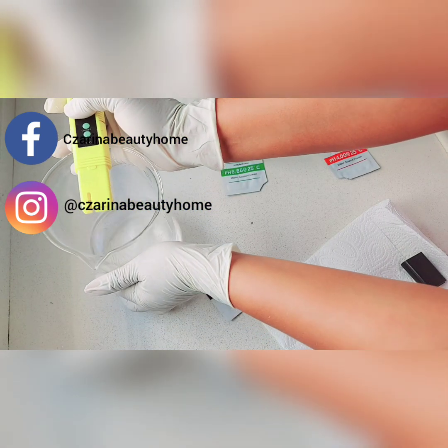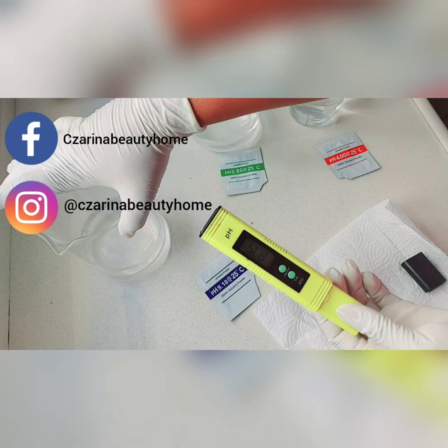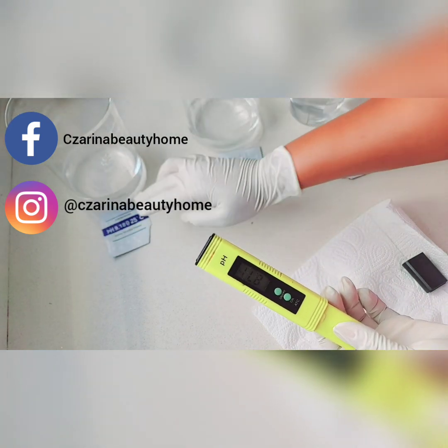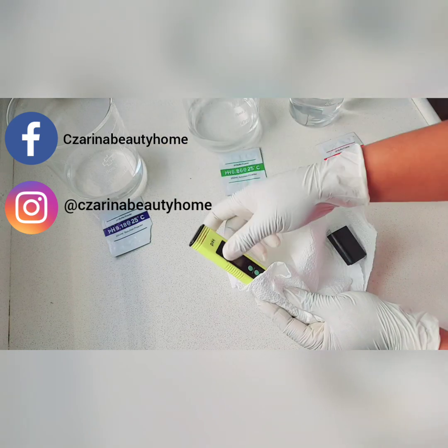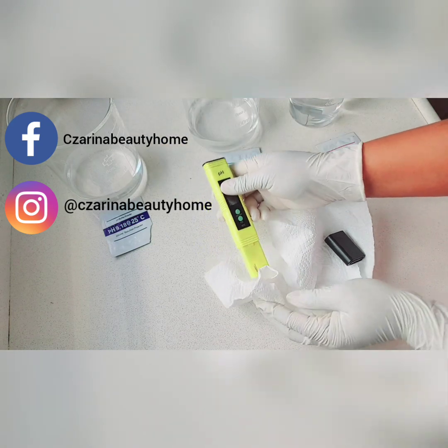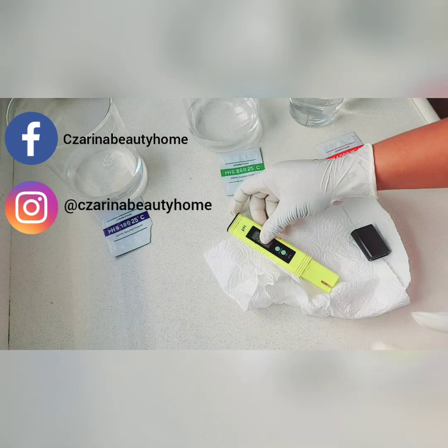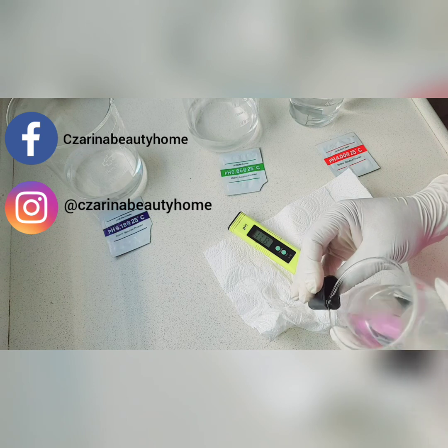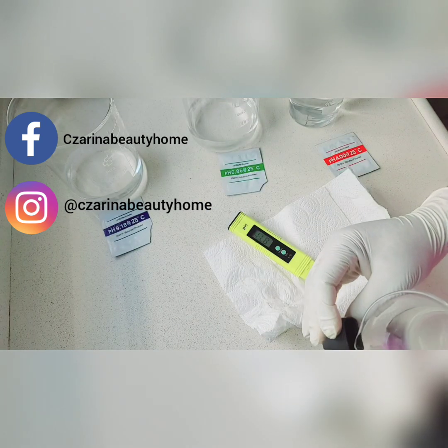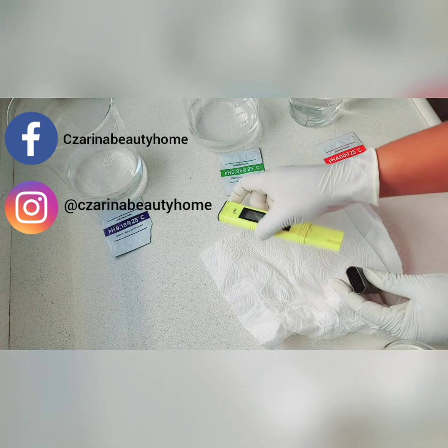Once you're done, rinse your pH meter in the neutral water. Then store it — you have to store your pH meter moist. Don't ever store your pH meter completely dry. That's not the proper way to store it. You just have to keep it moist.